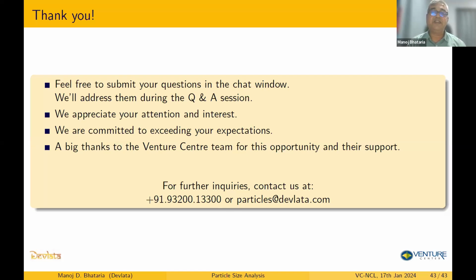Second is, let's say we have 2, 3 choices. Water is a polar solvent, so it's going to attract a lot of dust. So if you can make the suspension in something other than water, it is preferred, because then it's easier to clean out the higher size particles if it is a non-polar solvent. With polar solvents, removing dust is going to be a major challenge, and it's going to remain that way. So those two factors you should consider.